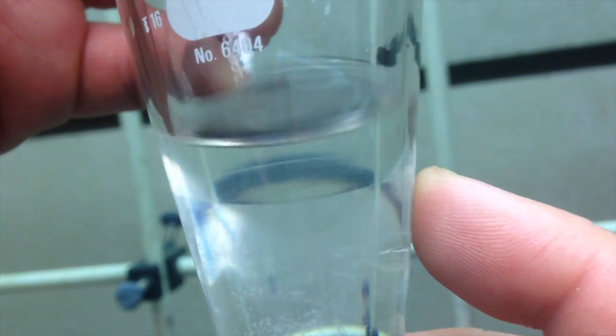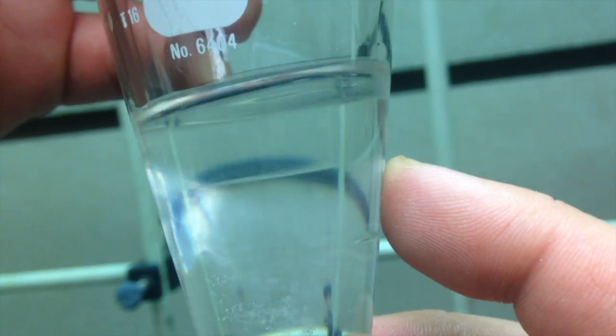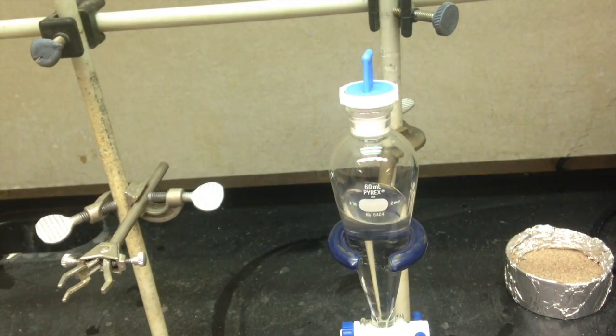Now, I got this nice clear extraction, but I cheated. Ultimately, this reaction almost always gives an emulsion. Basically, you create a white chemical mayonnaise inside your separatory funnel. To get rid of this, add a little bit more water, a little bit more ether, shake again.